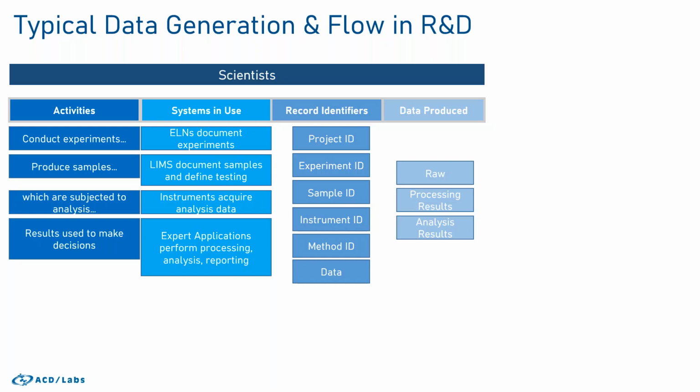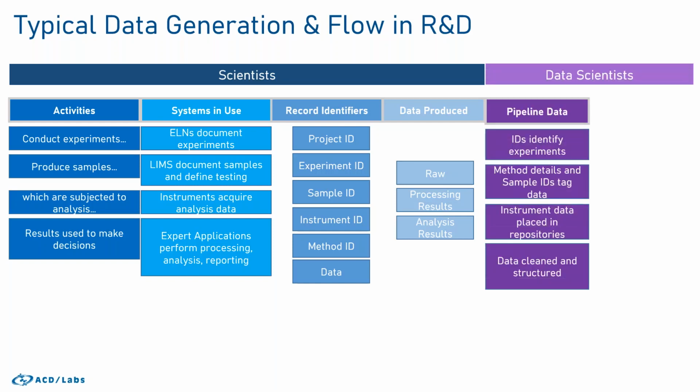And generally, that's the case for the interactivity for the scientists in the lab. But now we also have to take into consideration the data scientists, right? So a new type of scientist, and they have their own requirements and their own use of data itself. So we have instrument data that is placed in repositories. The data format that they require is slightly different. They require data to be cleaned and engineered and structured and standardized in order for it to be useful for them.